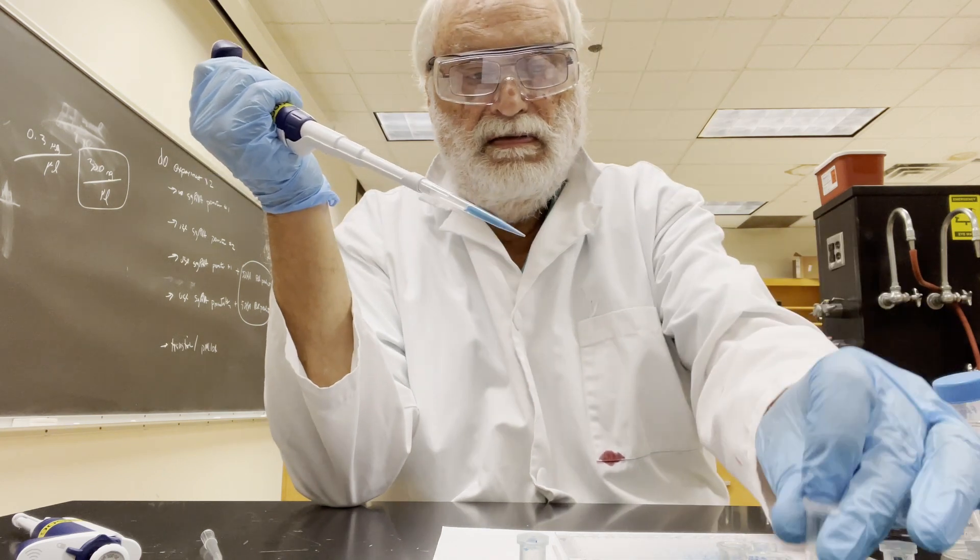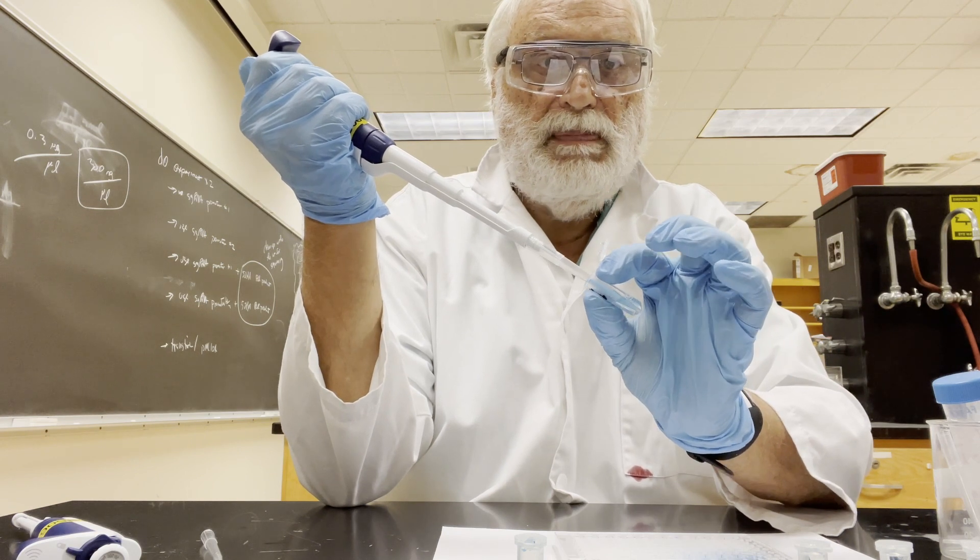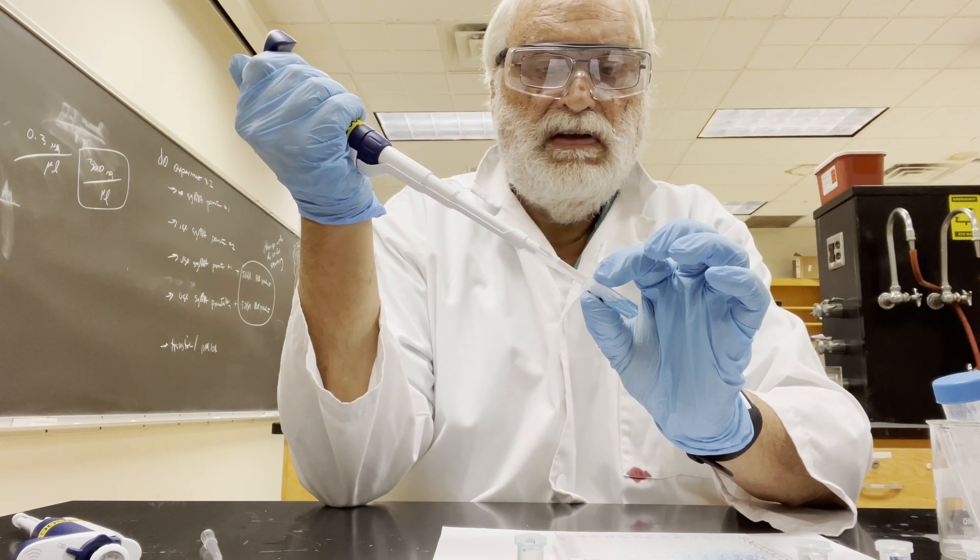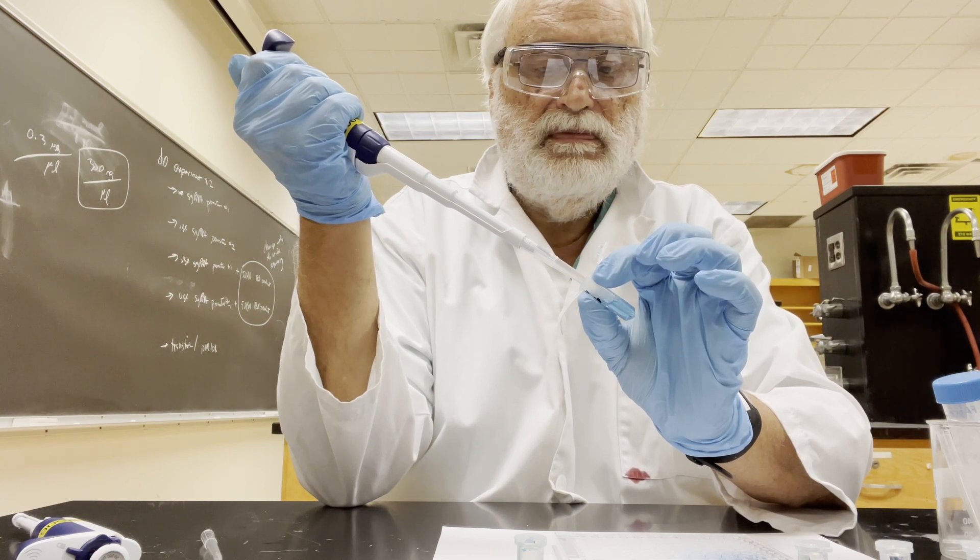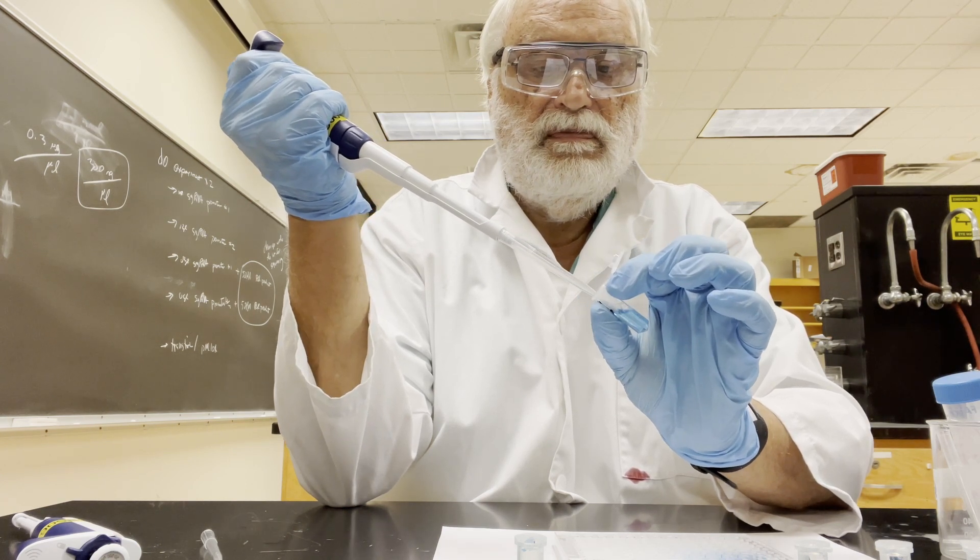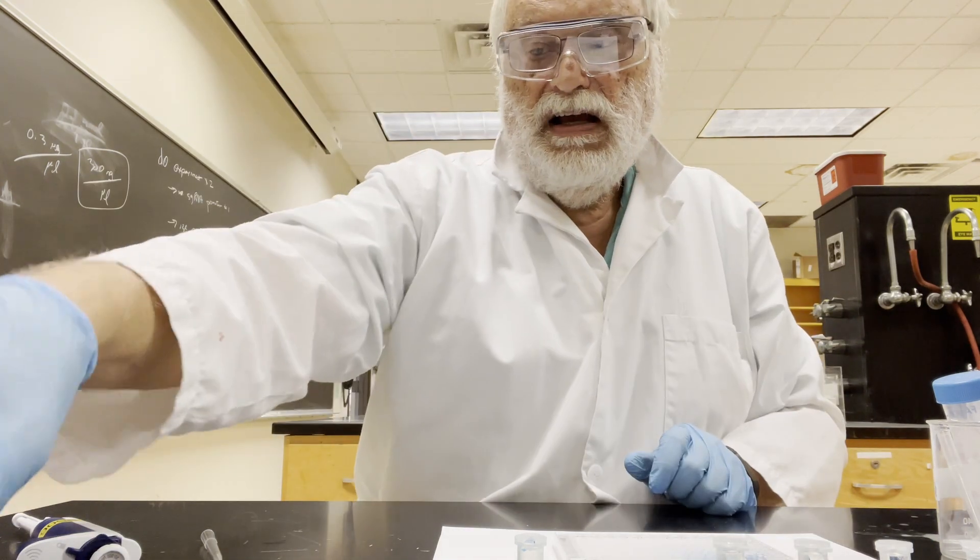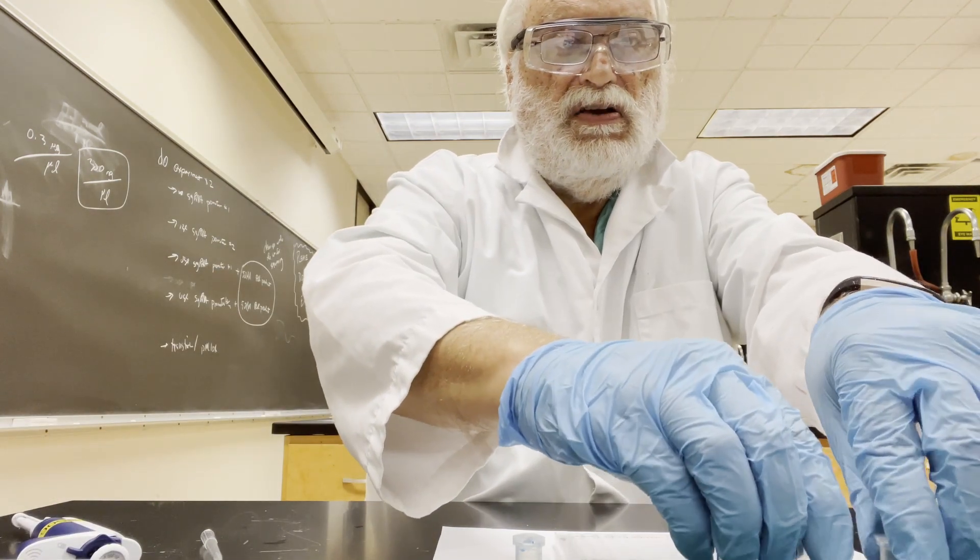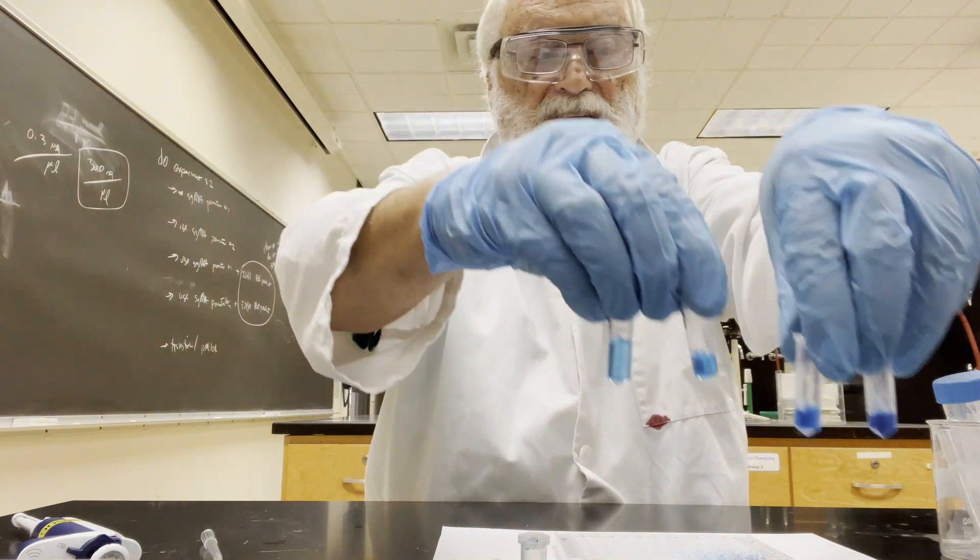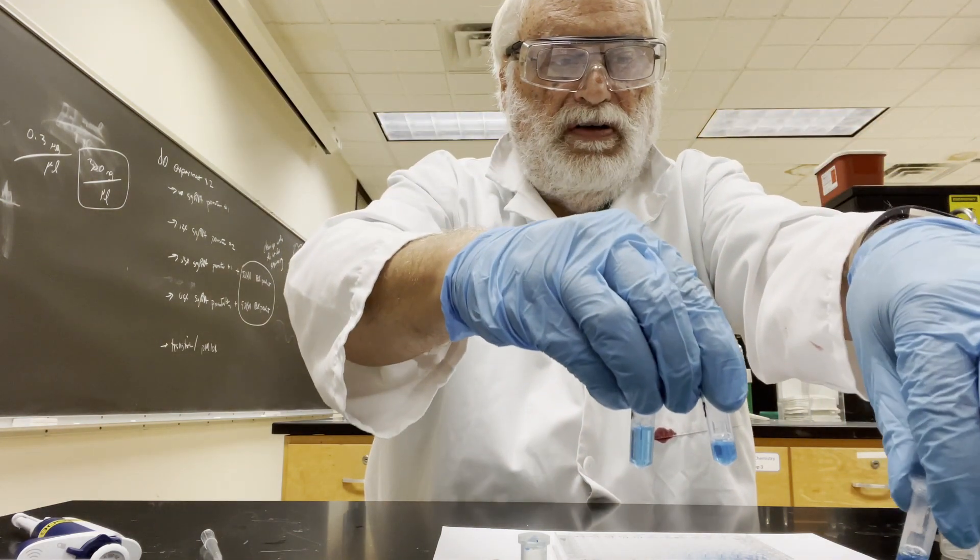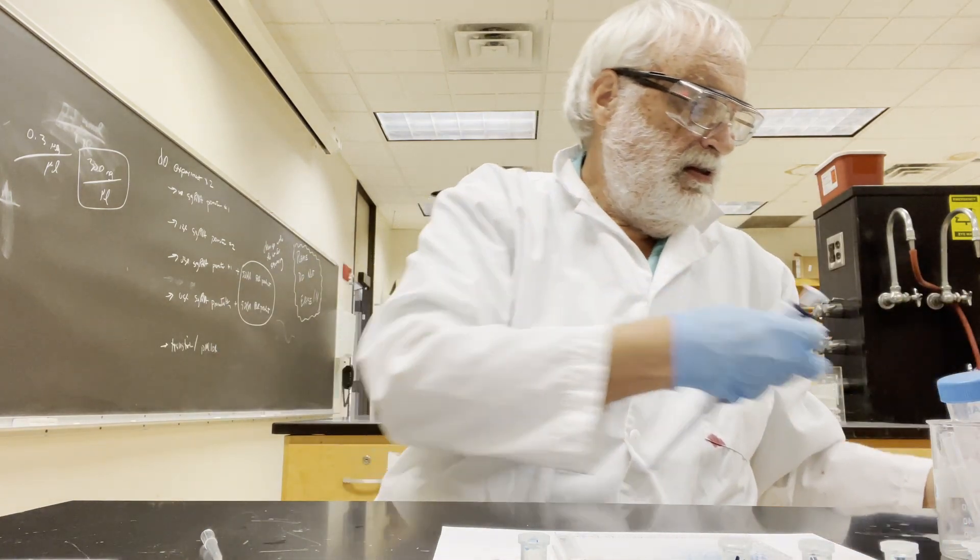I have a half a milliliter at the end, now I'm going to the one-sixteenth. Notice that I'm just pipetting up and down just to mix and you see the solution is a lighter blue. So we now have made a series of dilutions in tubes and you notice that each one of these is a lighter color. Notice the tube at the end has a larger volume, so the next thing to do is to place them on the plate.